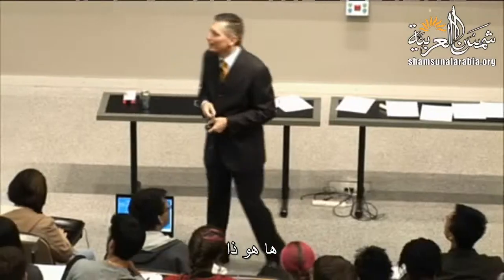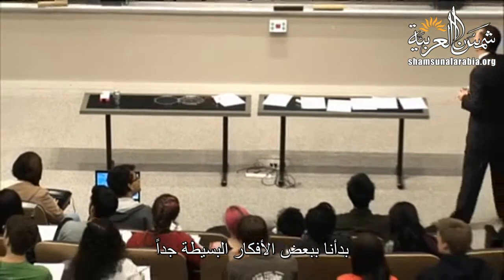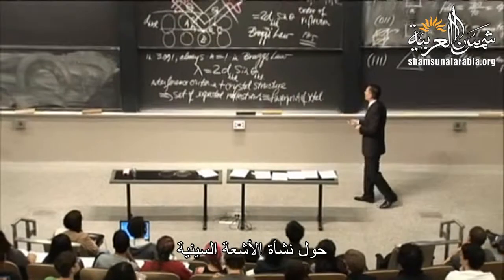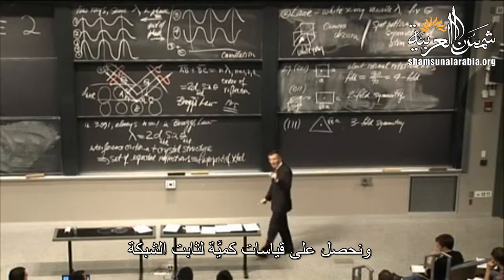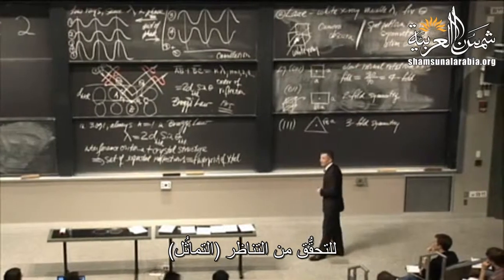So there it is. So where have we come with all this? We've come with the ability to start with some very simple ideas about X-ray generation and come to the point where we can characterize crystals, get quantitative measurements of their lattice constants, and by using X-ray techniques, investigate symmetry.